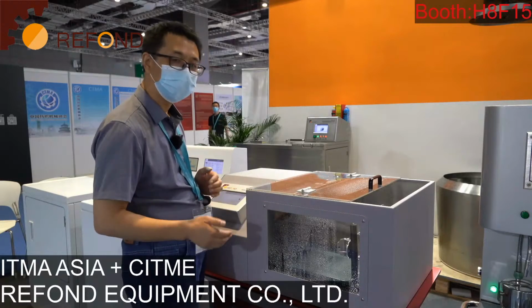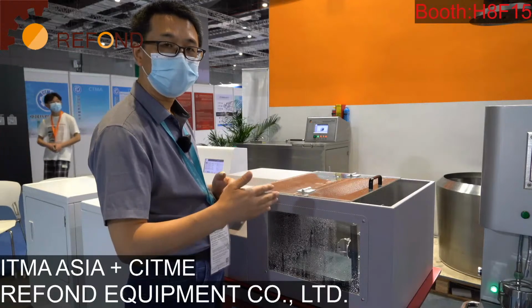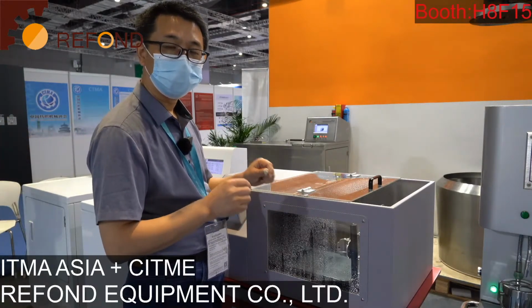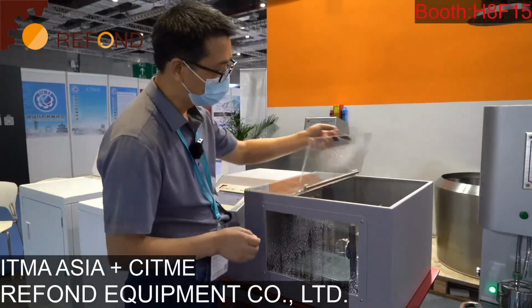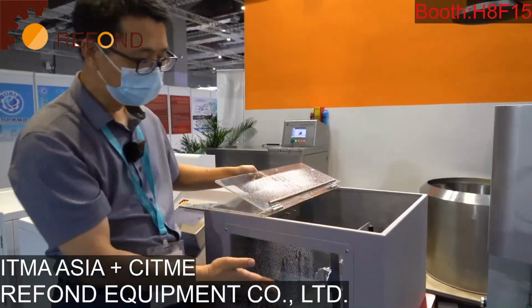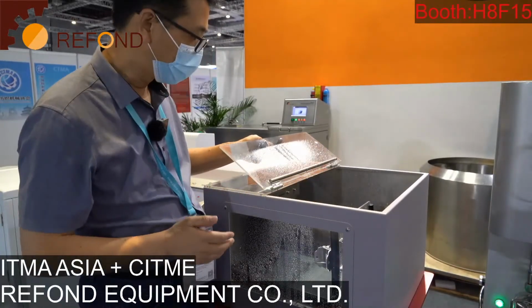The testing method is to use an AATCC blotting paper on the backside of the specimen and clamp the specimen in front of the AATCC blotting paper, in the specimen holder, and the water will impact on the top surface of the specimen.